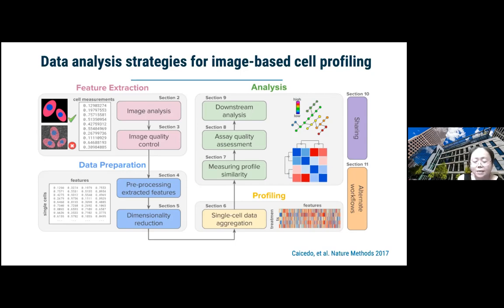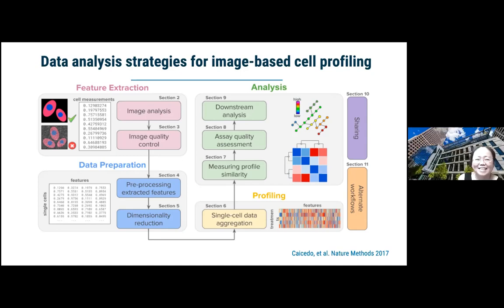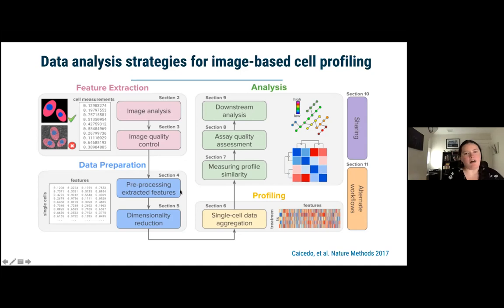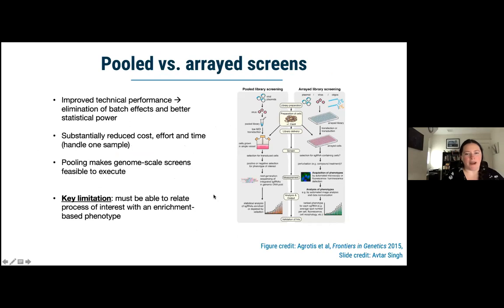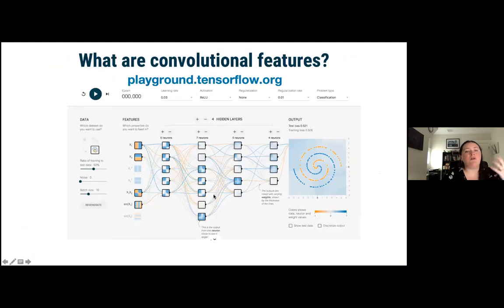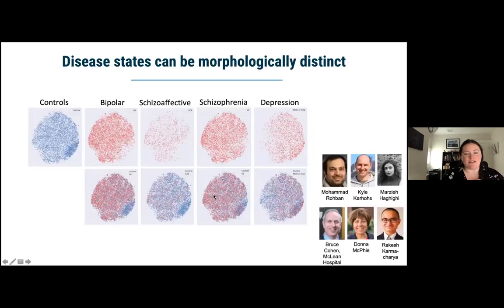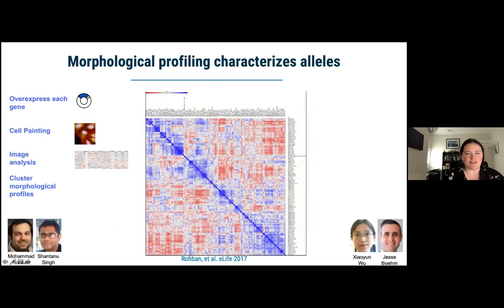Certainly, I need to catch up on reading your publications. I wondered, have you used CellProfiler to look for subcellular feature changes, like the ER and Golgi and things like that? Yeah, that's a great question. We often don't make direct measurements of things like the ER and the Golgi in terms of calling them objects, but we absolutely do measure them, and that's a big part of those 6,000 measurements I mentioned.